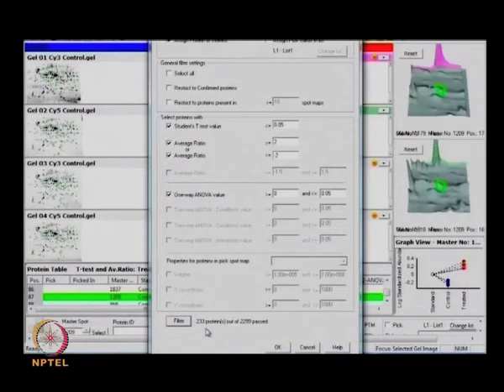So, can you elaborate on what EDA, or extended data analysis, is, and what it can do which we are unable to do in BVA? So there are layers here, right? One is DIA followed by BVA, and then ultimately EDA analysis. Exactly. Basically, what we can do here is compare two BVAs together. Here we are talking about a particular disease or particular set of data only. There we can analyze different BVAs together in EDA. There you will get majorly differential expression, as well as PCA and discriminant analysis. These kinds of statistical data you will get in EDA.